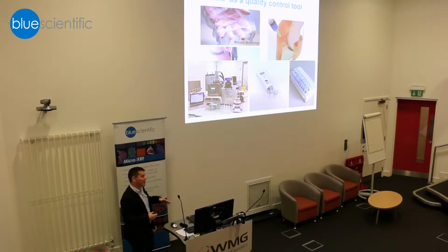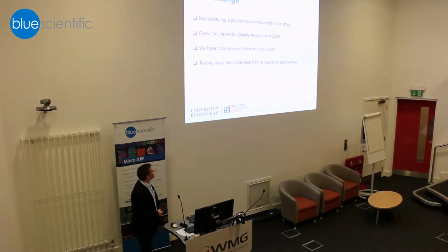Now, we don't manufacture the clinical grade at university. We build the manufacturing process and we port that across to a clinical facility. But also, we need to understand what's coming off this manufacturing line. Is it within tolerance? And actually, how does the chemistry of the material change during manufacturing, which has been the source of a lot of big hiccups in the past when it comes to adverse reactions in the clinic.